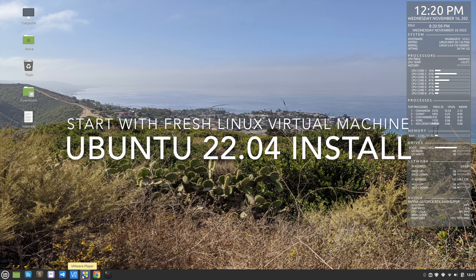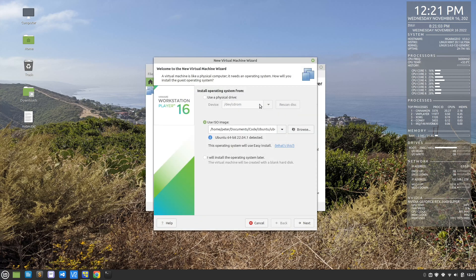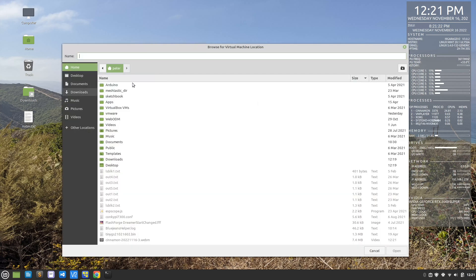We're going to be starting with a fresh Linux machine with stock Linux. The first few minutes are just setting up the virtual machine. We'll be using Ubuntu — the ISO is already downloaded and will be used to spin up this virtual machine using VMware Workstation Player. Both the ISO and Workstation Player are free software.